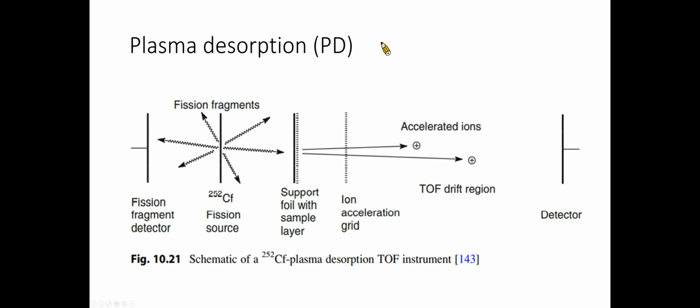In Californium PDMS, particles of mega electron volt translational energy are created from radioactive decays of Californium nuclides, the nuclear process being the source of their kinetic energy. Each event yields two nuclides of varying identity, the sum of their masses being the mass of the former nucleus.